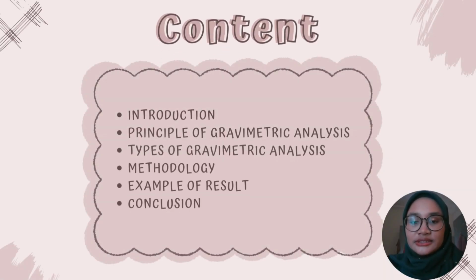So this is the content for our video: introduction, principle of gravimetric analysis, types of gravimetric analysis, methodology, example of result, and lastly conclusion.